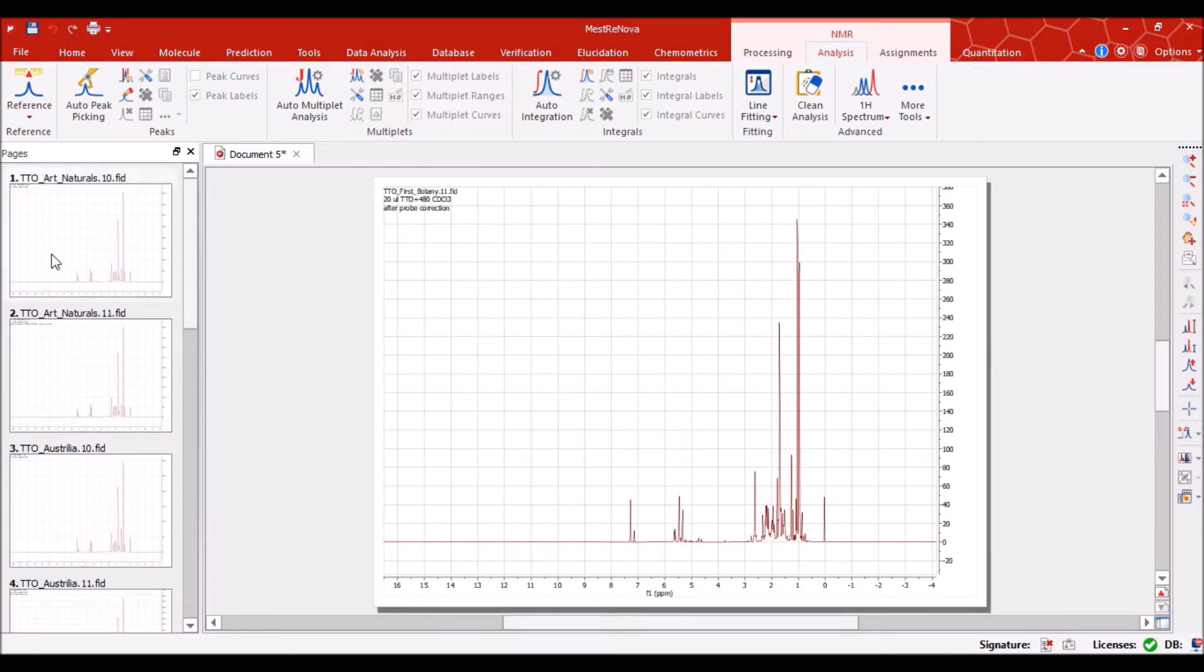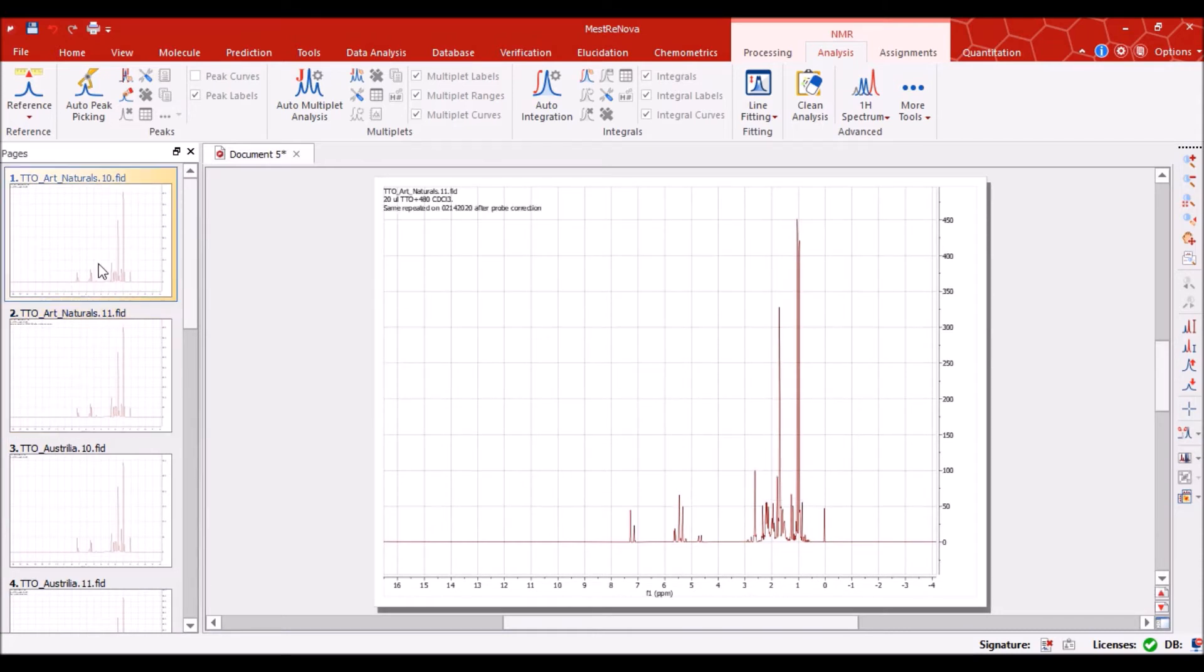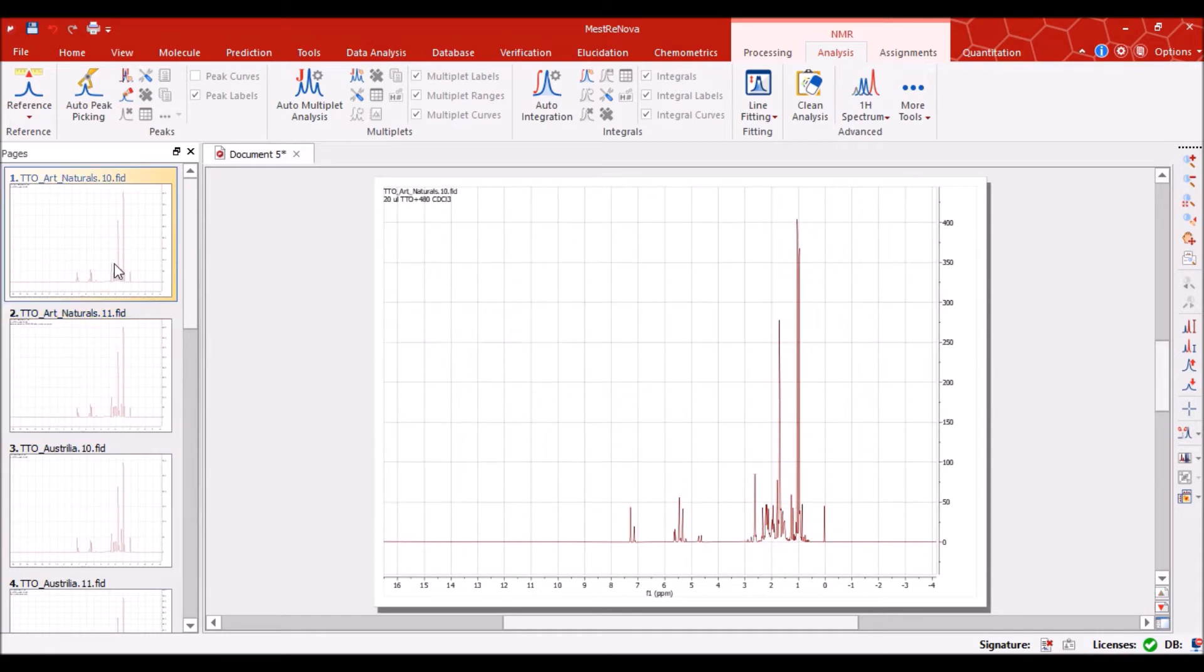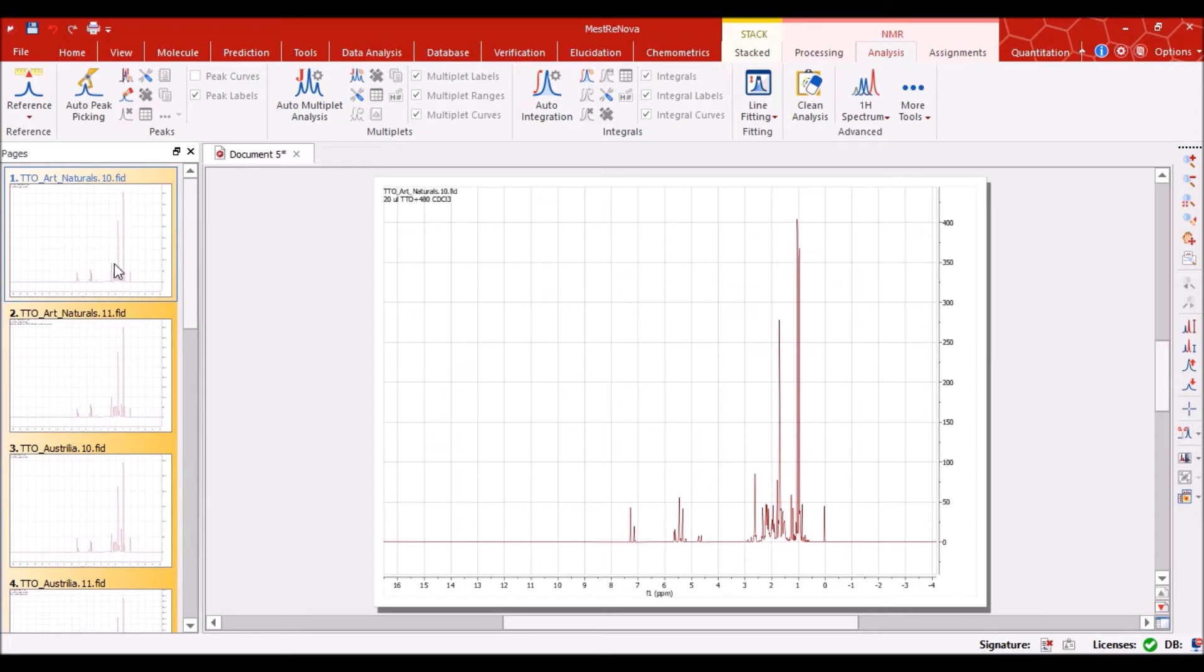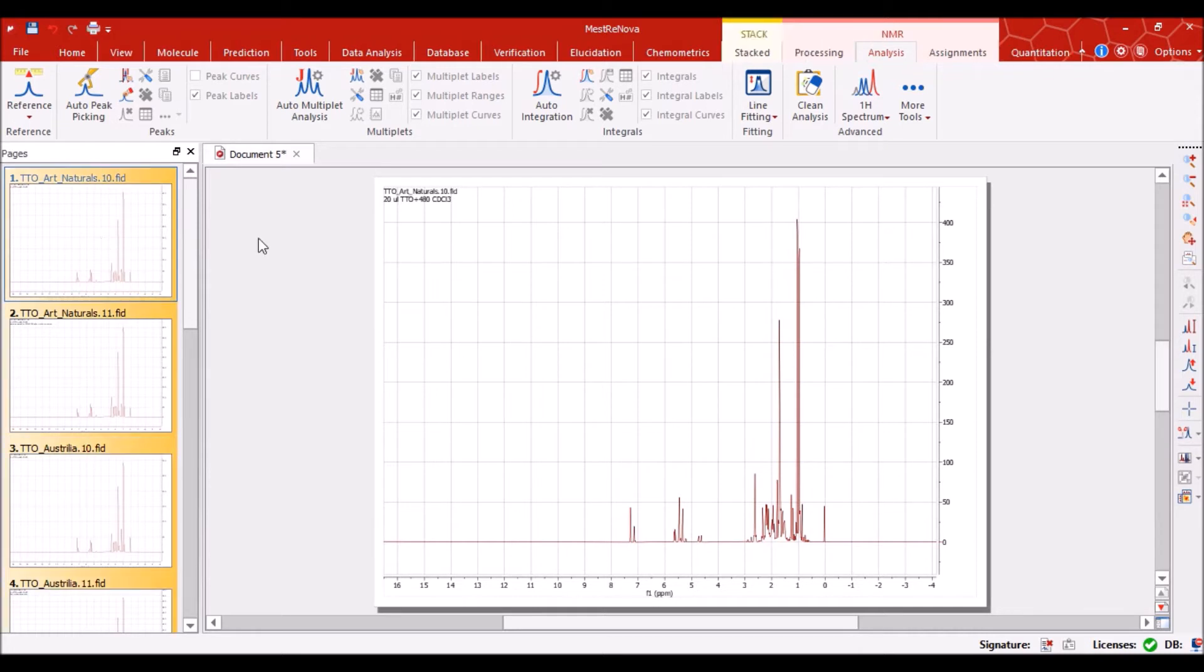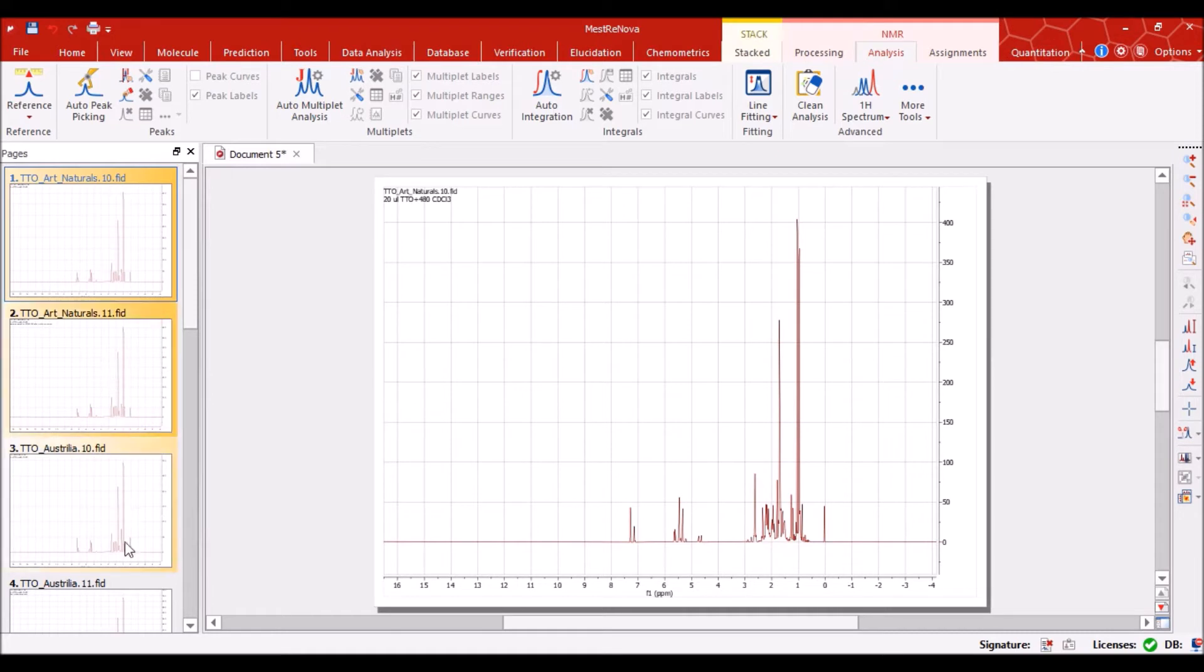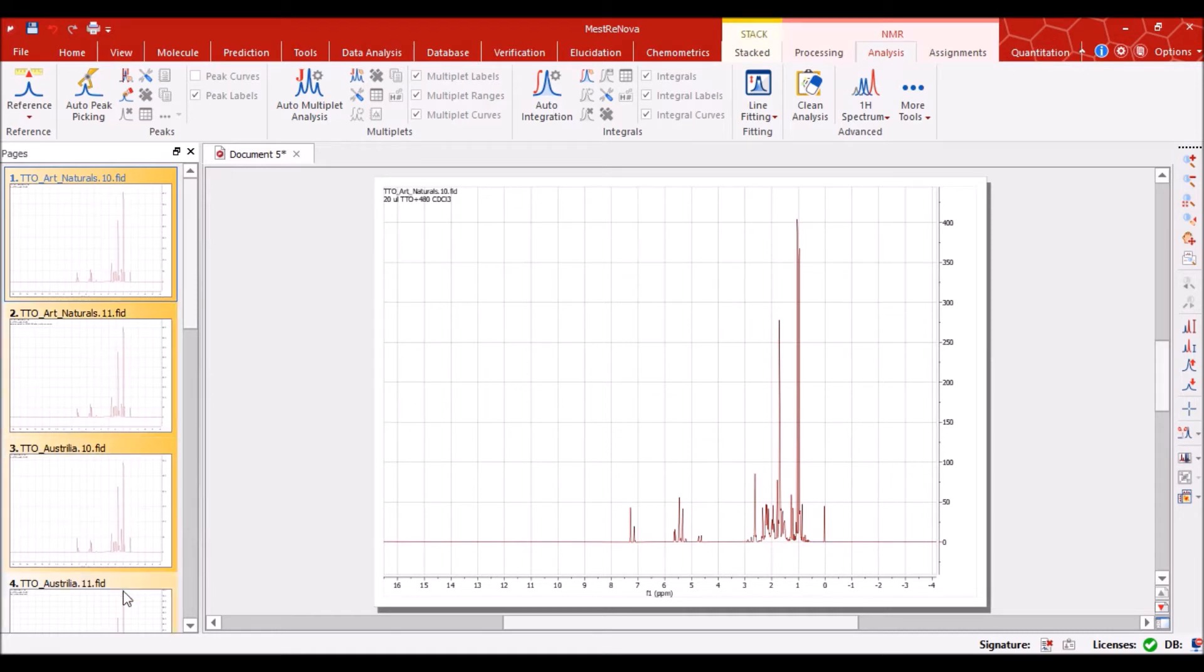This is our data set, our spectral set. Now we can select all these slides, our spectra, by just clicking ctrl and A. So I selected one then ctrl and A, I can select it by clicking on one and then ctrl.